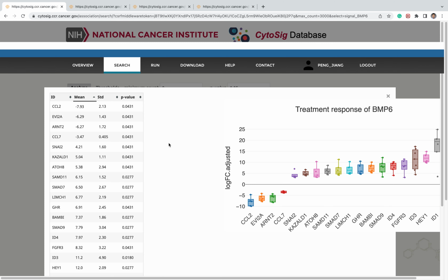The significance analysis function will identify differentially regulated target genes of the current cytokine. For each target gene, the module compares log fold change values from different studies with 0 through the two-sided Wilcoxon signed rank test.